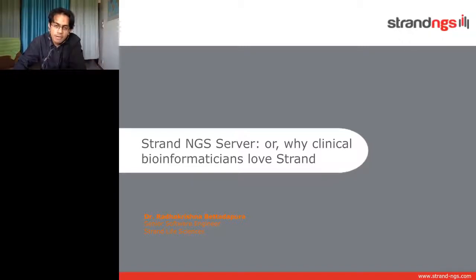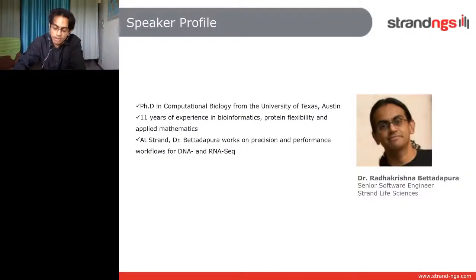A little bit about myself. I'm a senior software engineer at Strand Life Sciences. I have a PhD in computational biology from the University of Texas. I got that PhD in 2012, and I've been working on applied mathematics and bioinformatics and protein flexibility, the nexus of these several interdisciplinary fields for the past 11 years. And at Strand, I actually work on DNA and RNA-seq, and today we'll actually be looking at DNA-seq in some detail.